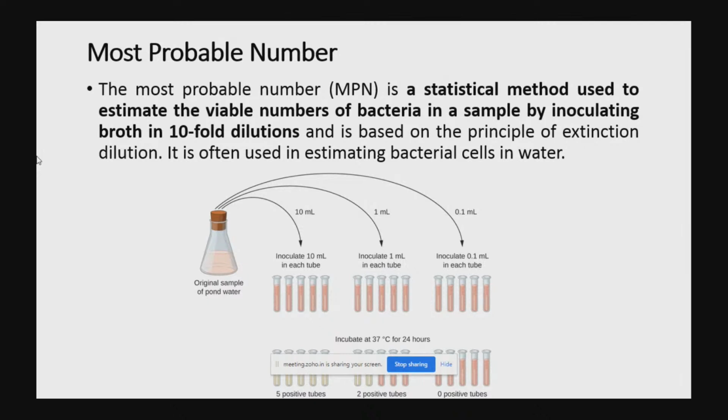But the pharmacopoeia suggests that the most probable number, the MPN method, is not advisable as compared to membrane filtration or pour plate techniques, because the consistency of the result is not good compared with the spread plate, membrane filtration or pour plate techniques. So it is not an advisable method to utilize for routine pharmaceutical testing.